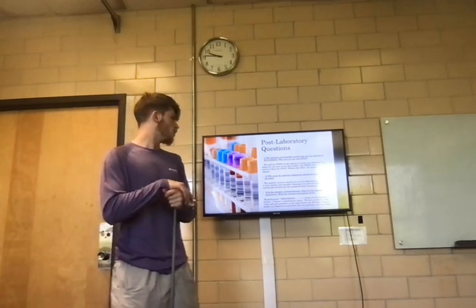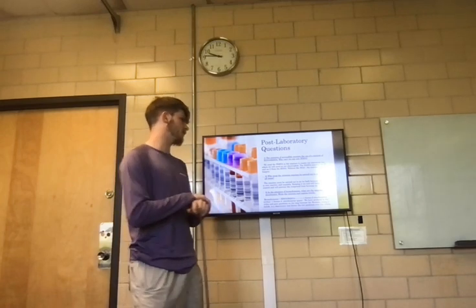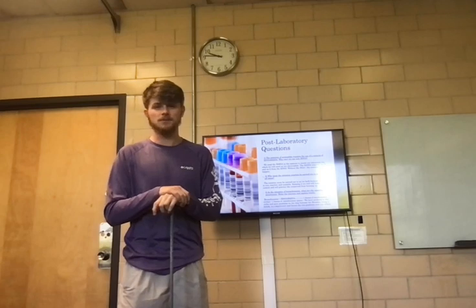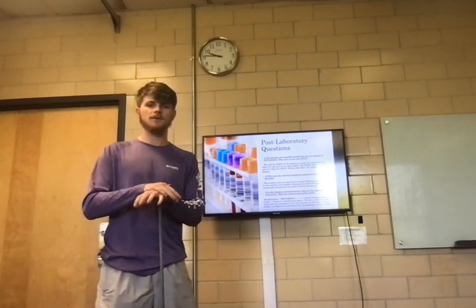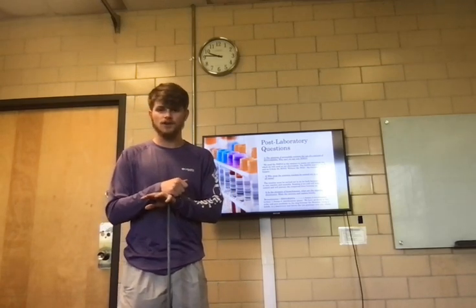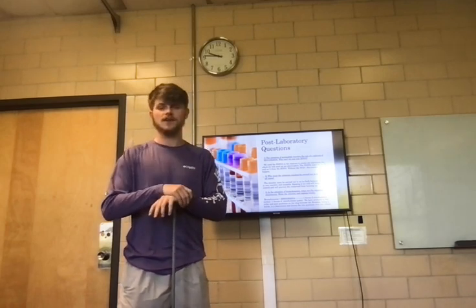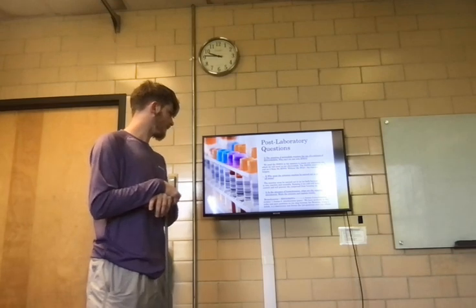Number 2, why must a nitration reaction be carried out in an ice bath at all times? Well, this reaction is very unstable, very reactive. Keeping it in an ice bath keeps it calm and cool. We don't want it burning up our products or burning up in general. Keeping it in an ice bath basically saves and preserves the reaction.